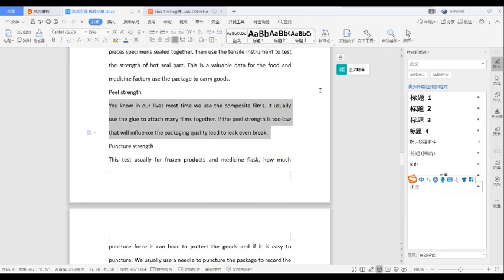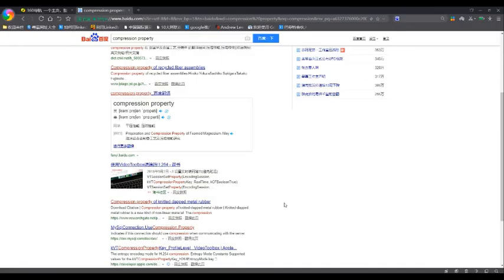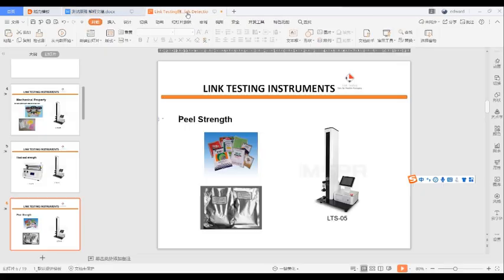performance, and then you will see small bubbles on the packaging surface. At the bubbles, it's very easy to be punctured, and then you will see a lot of leaks in the packaging. So before that, as food packaging, medicine packaging, or chemical packaging, QE and QC departments must do the testing of the peel strengths of the packaging materials.